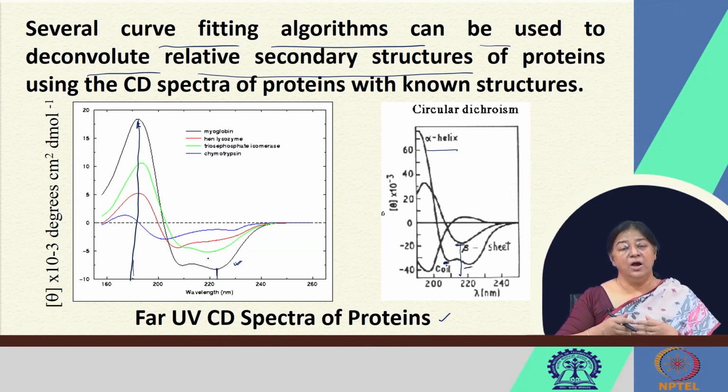So, looking at the secondary structure component, which is an important part of a folded protein, is going to give us information that we would require to see whether we have the correctly folded structure. When we are looking at the IR spectra, we are looking at the amide 1 and the amide 2.